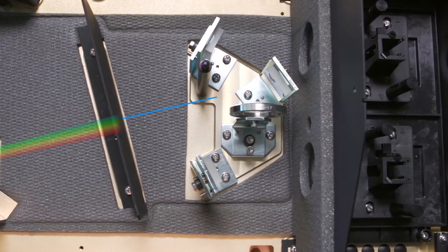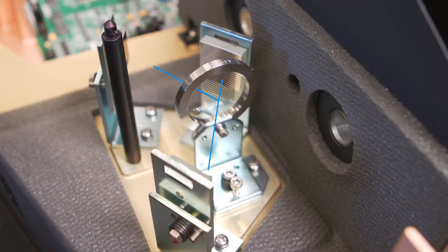The selected wavelength of light is redirected to a pattern mirror, where half the light is transmitted through and the other half is reflected.